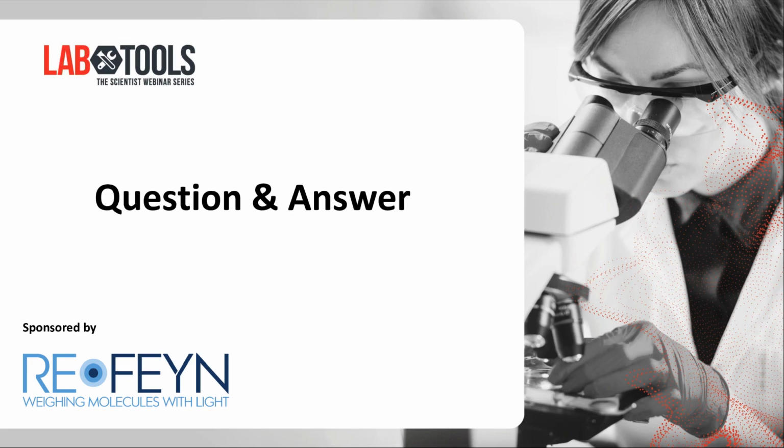Yeah, maybe I can start to answer this question. So maybe I start with the second question. Mass photometry has been used for integral membrane proteins with nanodiscs, but in that case, you can do the simple landing assay as is normally used in mass photometry experiments, because basically what you do is you solubilize your integral membrane proteins, and then they land as normal soluble proteins on your surface, and you can determine interactions with it.